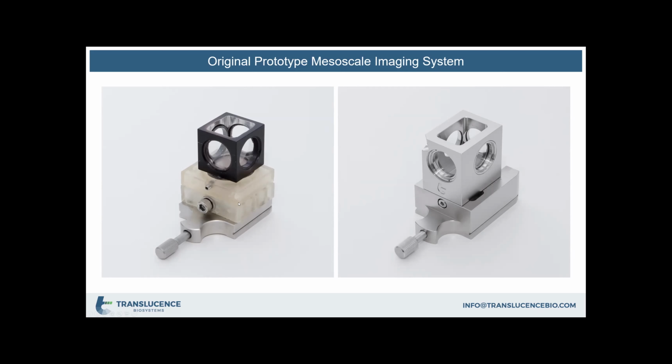So we started using it with this, and then Zeiss came to us and said, hey, this is cool what you're doing. The fact that you're able to do these tissues, wouldn't you want to make a commercial version of this to sell to our customers? Because then more people can do this. And that's why we came up with what you see on the right, which is a much nicer looking version of the same thing that we were selling to the Z1 customers to help them do high refractive index large tissue imaging on the Zeiss microscope. And it's now sold through Zeiss as an add-on for new purchases of the light sheet 7, or for people like UBC that have light sheet Z1 and want to use these things.